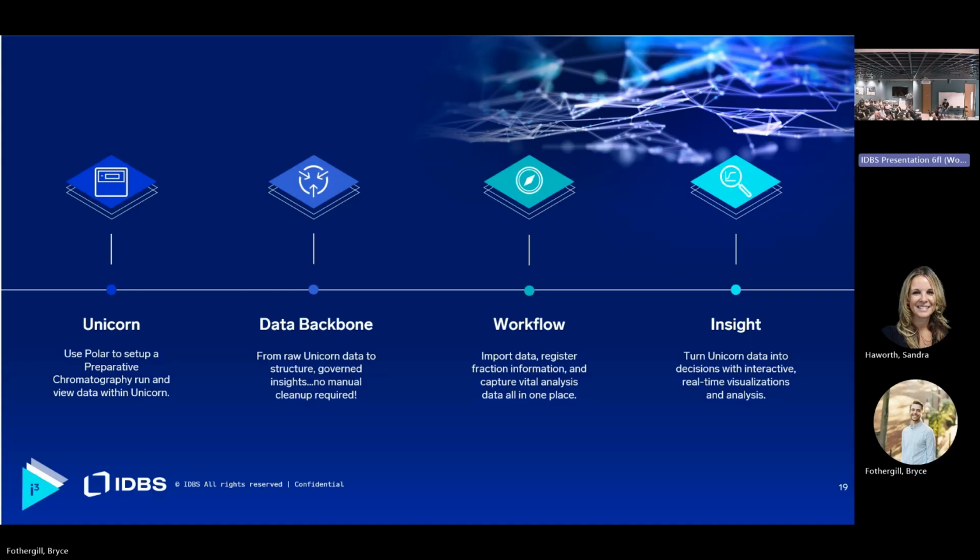So Nick, how do you want to take this, or can I take it? Okay, so that is on the roadmap, right? So currently it's sort of just through GPS, through us, with the pre-built and custom applications. But the idea eventually is, yes, you can add your own Insight app that makes sense to you and what you're working with. But in the meantime, unless Nick, you have anything else to add, that's sort of where it is at this moment. Great, thank you. Awesome, thank you, Jen.